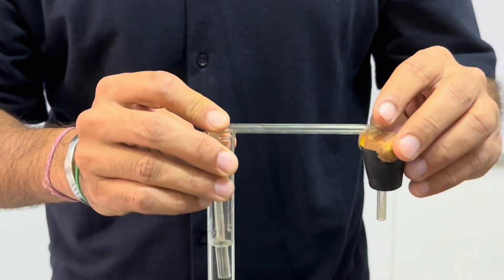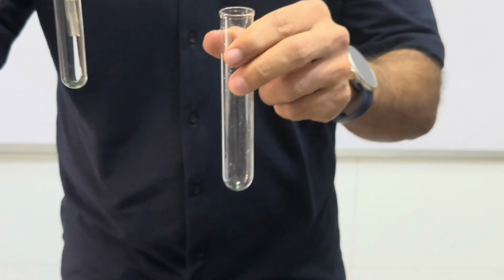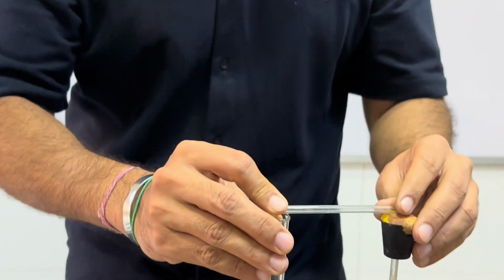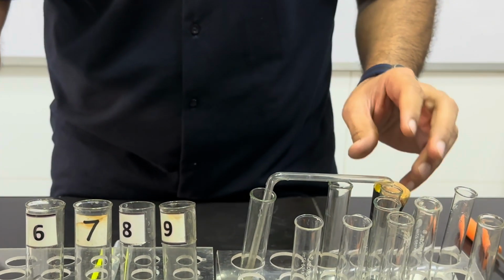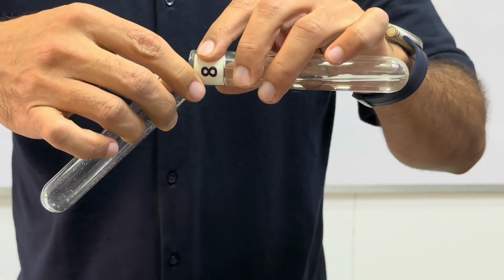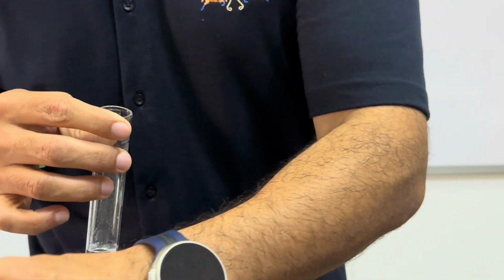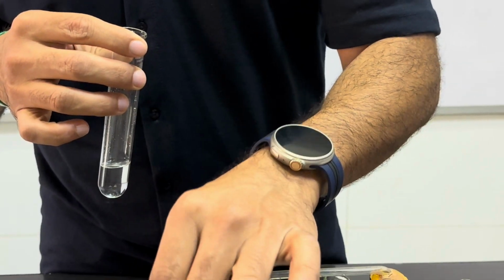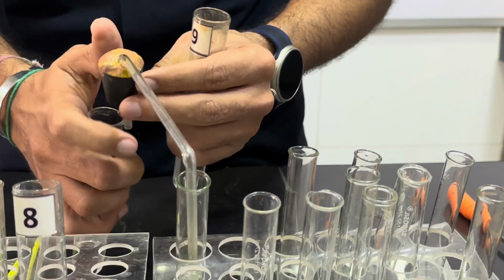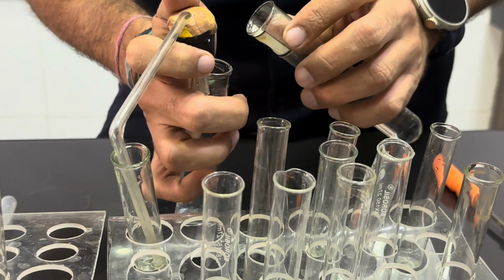Now we will add the chemicals in the other tube and rapidly put the rubber bung there like this. So let's quickly add FB8 first, followed by FB9. But before we add FB9, we must have this rubber bung at the top, ready to be placed.